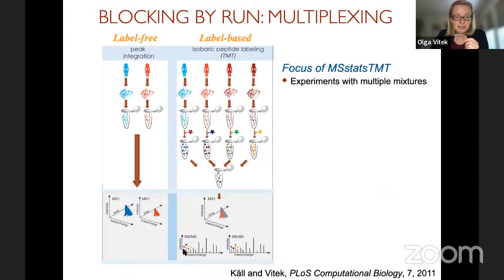secondary or tandem mass spectra. So we have reporter ions, which characterize each of the original samples. So now, instead of looking at the intensities of these peaks, we're looking at the intensities of the reporter ions. And we have to summarize all this information as pertained to the protein to ask questions whether, for example, the healthy sample is different from the various disease samples. Now, this is fairly complicated because we are now changing the quantification from MS1 level to MS2 level.